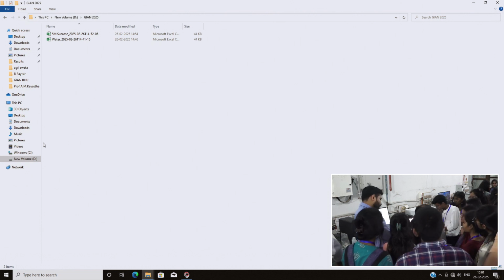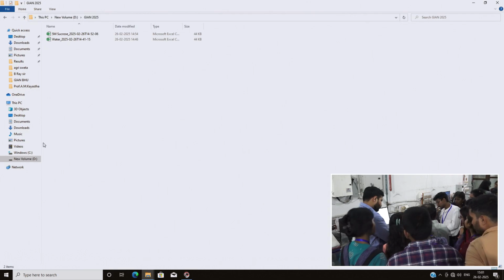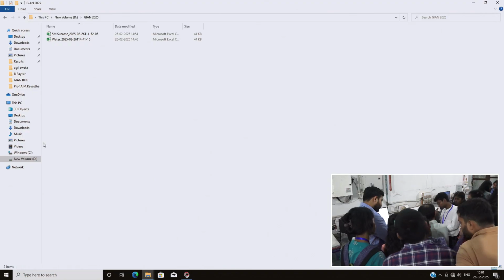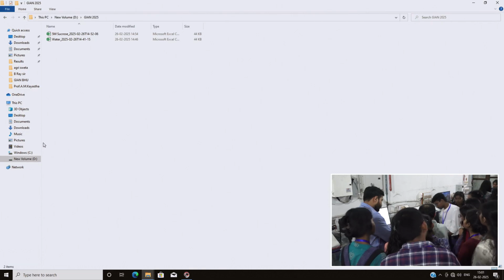Sir, is there any way we could get the peak numbers on the plot, so we could pinpoint the exact wave number? The dips will have a particular wave number which can be denoted in this spectrum.